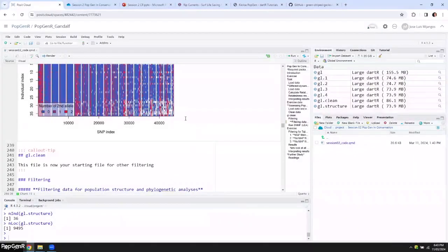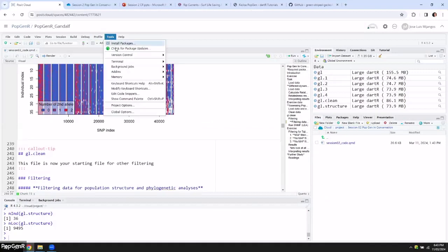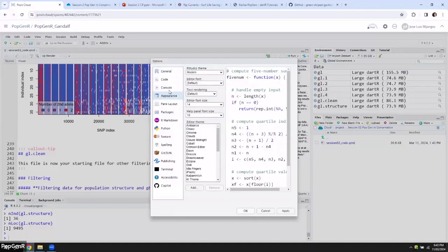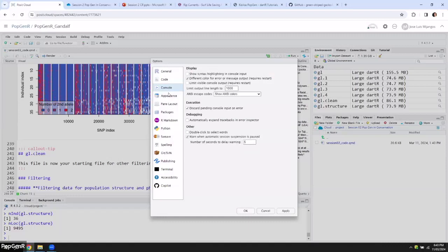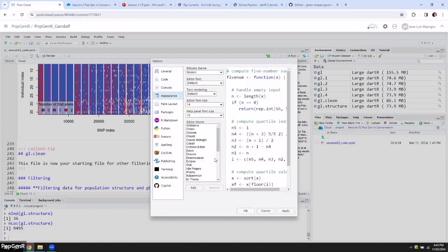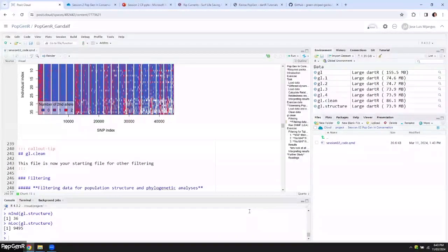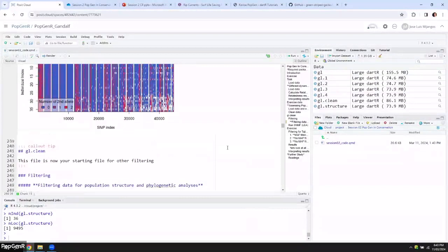Because I normally do it basically at the very start. But the secondaries filter is basically often just randomly choosing one. So if you run the remove secondaries early, you might have a bad one that's going to get deleted and a good one you're going to keep, but you don't get to choose that. But by running it later, you're getting rid of all the bad ones, and if you still have secondaries, they're both good. So you're kind of artificially losing loci that you probably don't need to. So I do secondaries much later so I can get rid of bad things before I get rid of secondaries.